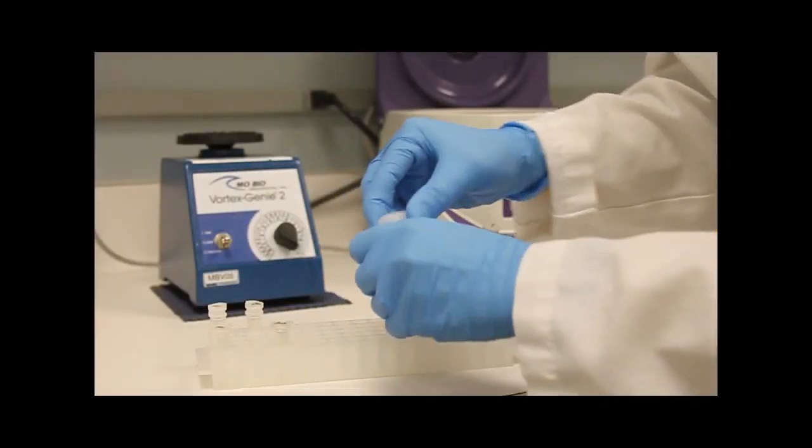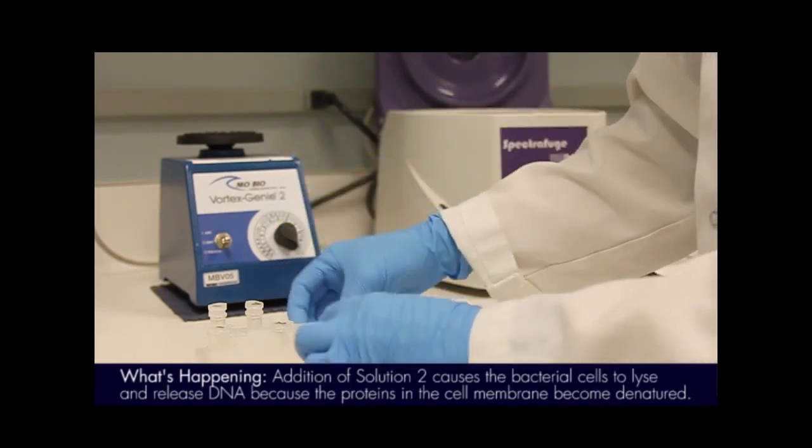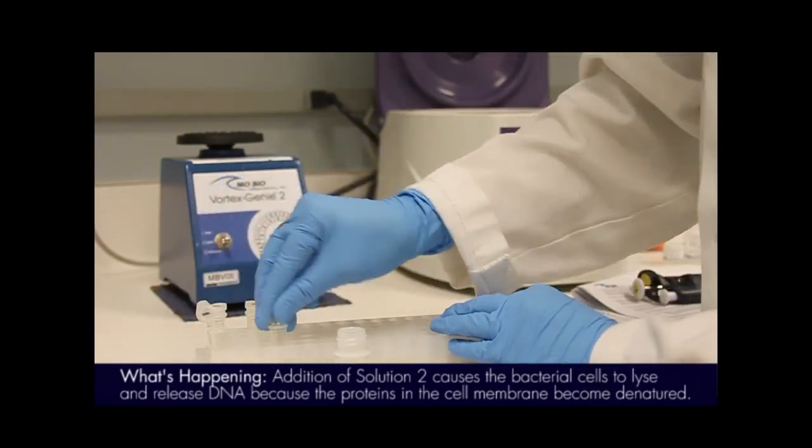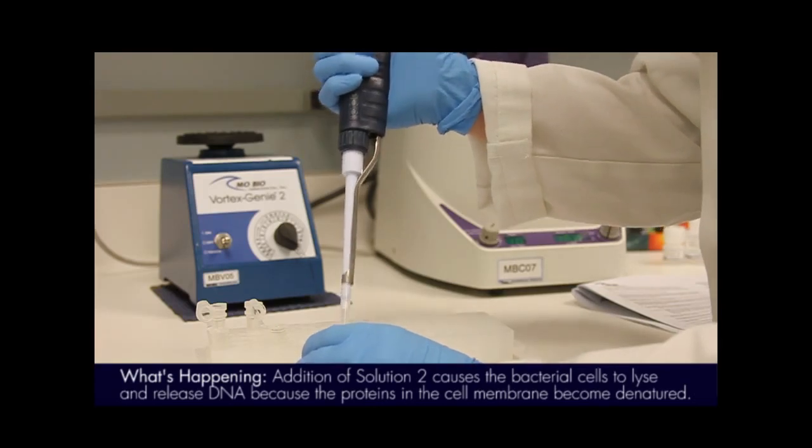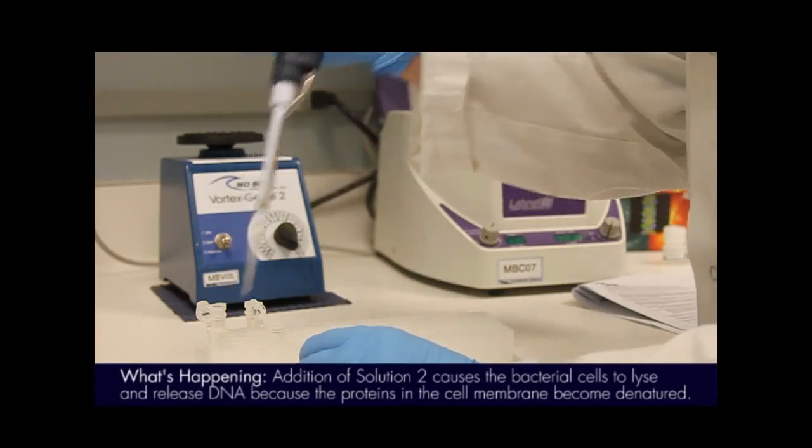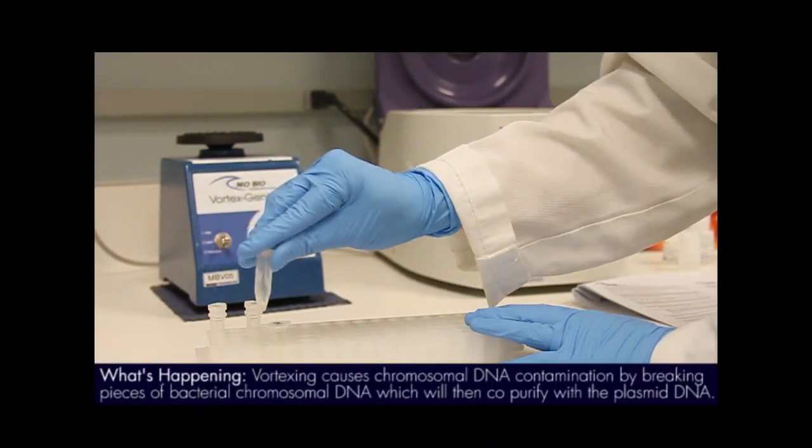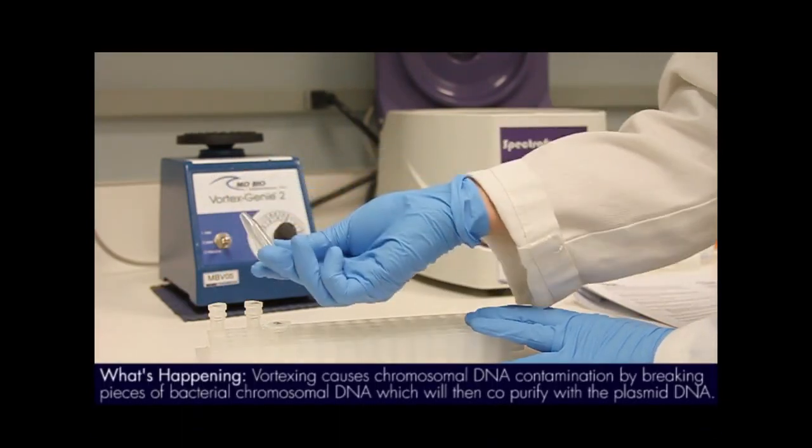Next, we will add solution 2 to the cell suspension to lyse the bacterial cells. Gently invert the tubes up to 8 times to mix. Do not vortex at this step.